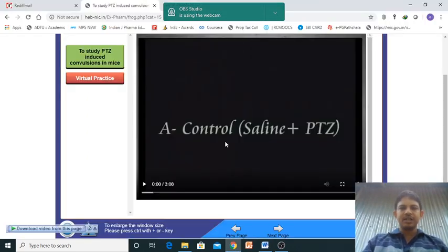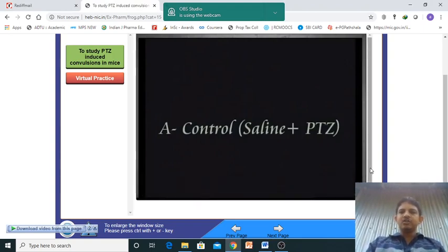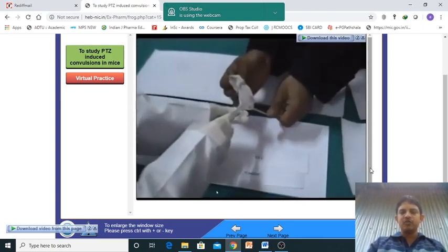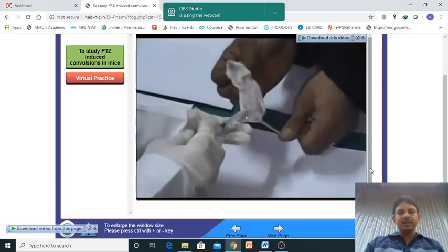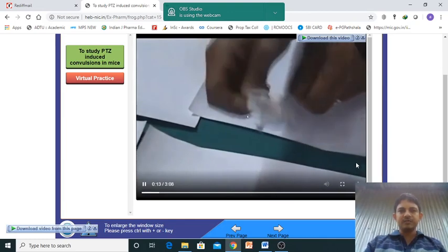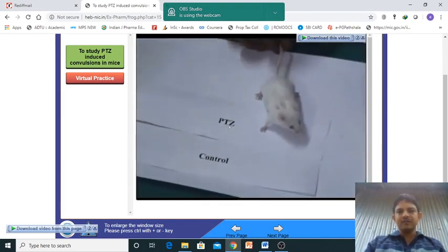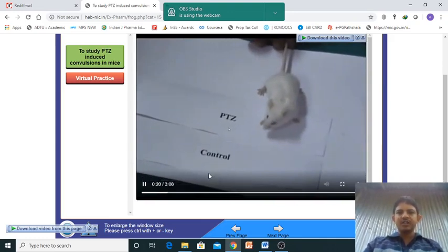Now I'll open the video so you can check it. In this experiment you need to observe and understand how convulsions are produced. You can find two groups here: PTZ and control.